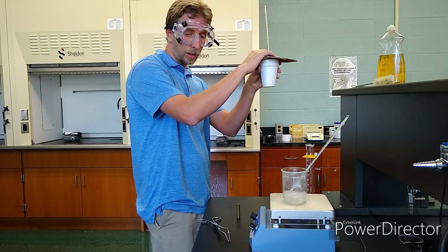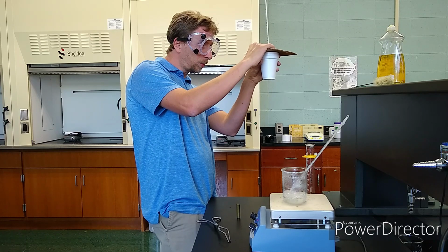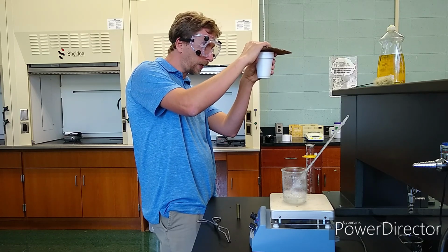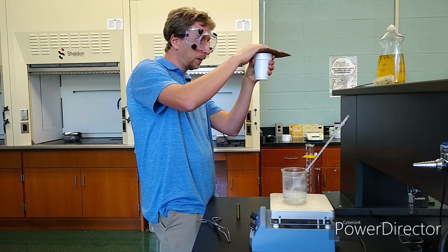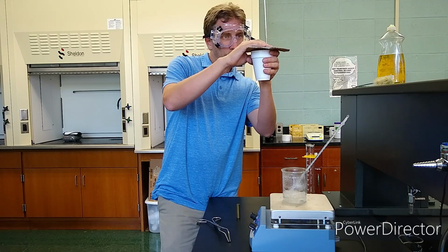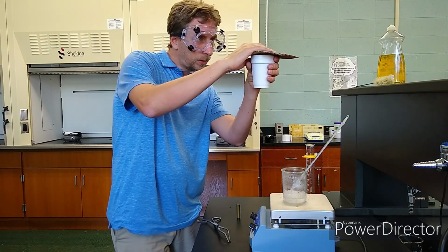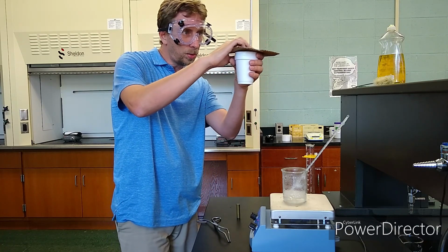So we've already gotten a couple of temperature degree units. Rising, it's up to 26.5. This is not a very good lid. I'm not happy with this lid. That's a source of potential experimental error right there. Okay, and now it's up to 26.7 or so.